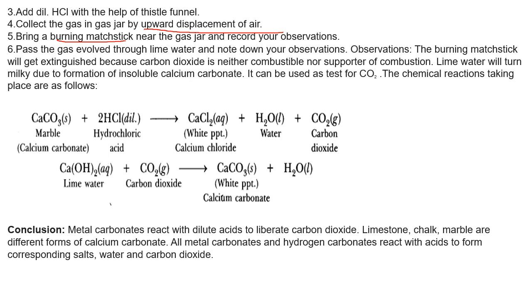Pass the gas evolved through it and pass it into lime water. Then you have to again note down the observation. Observation will be the burning matchstick gets extinguished because carbon dioxide doesn't support combustion, right? Then the lime water turned milky. This we have done, and you have to write the proper chemical reaction.